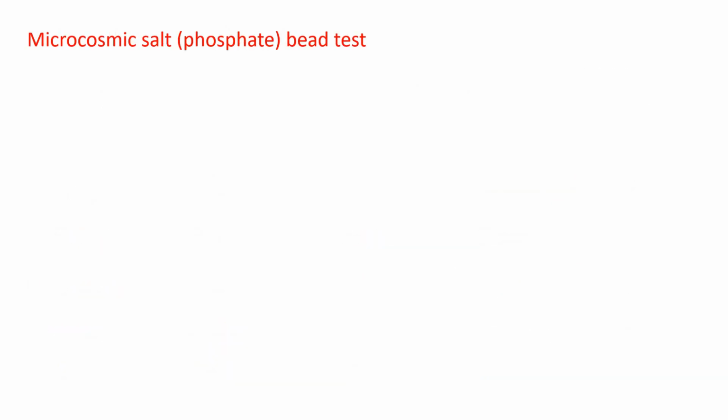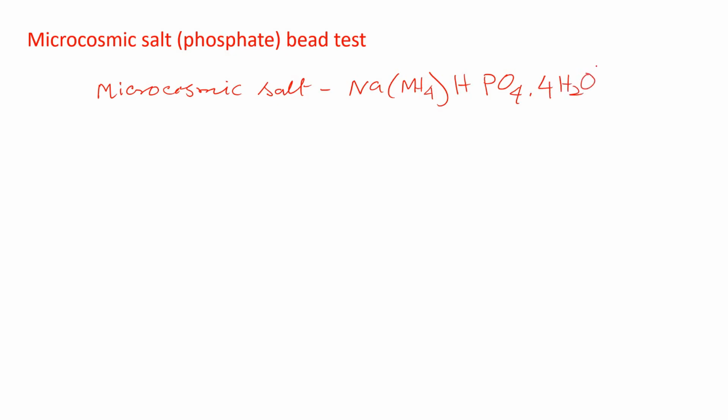Now coming to the microcosmic salt bead test or phosphate bead test. Okay. What is microcosmic salt? Microcosmic salt, I'll write, microcosmic salt. It is nothing but sodium, ammonium, hydrogen, phosphate. This is microcosmic salt with 4 water of crystallization.